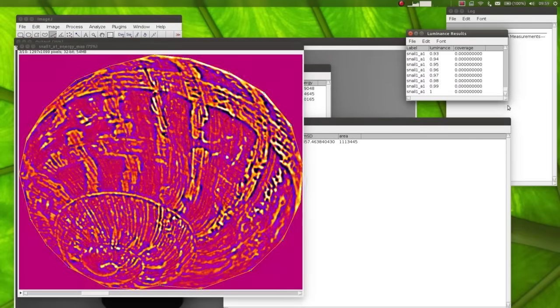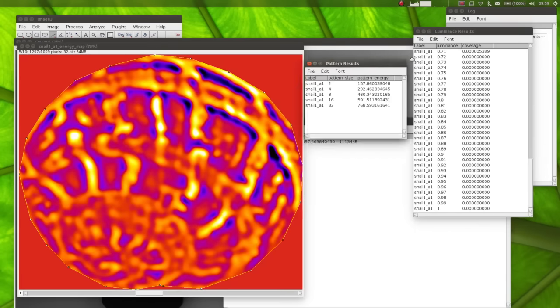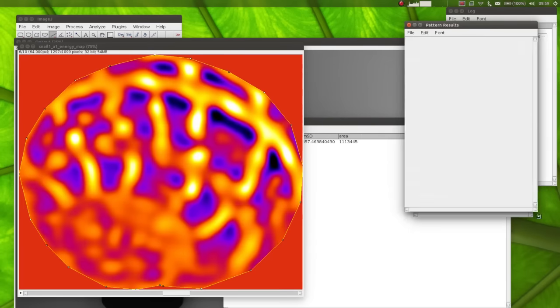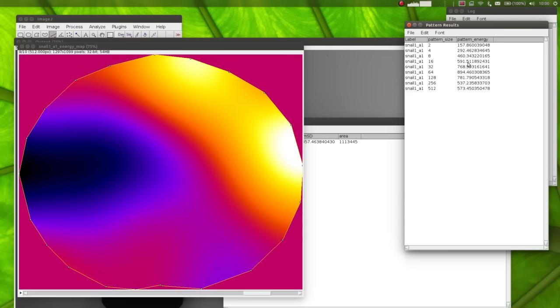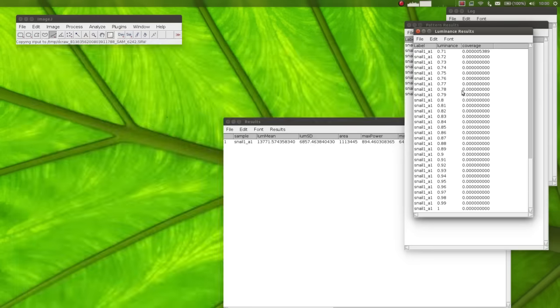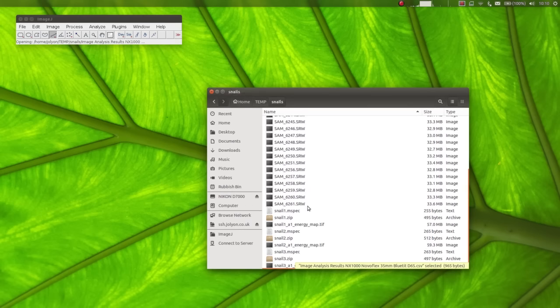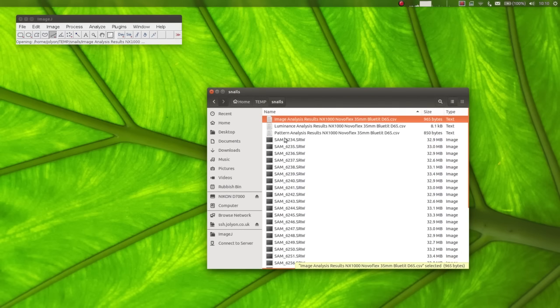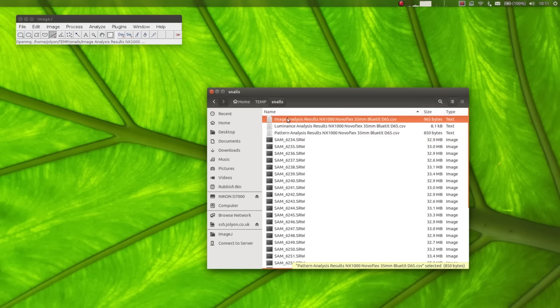So as this runs, you'll see there are luminance results being created here and pattern analysis results being created here. So this is showing you the pattern size and the amount of energy at that spatial frequency. Once image analysis is completed, all of the results are automatically saved as it goes to the directory containing the multispectral images. So here you'll see three different files. The main image analysis results are in this file.